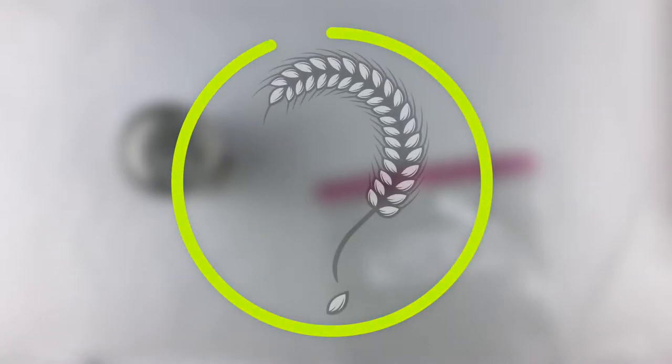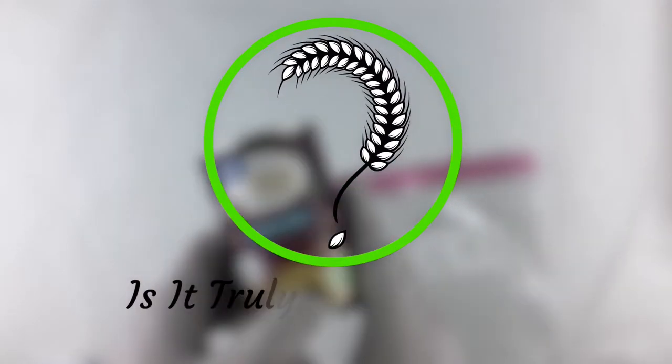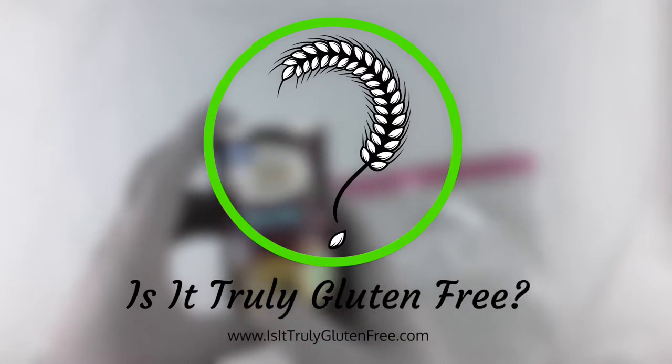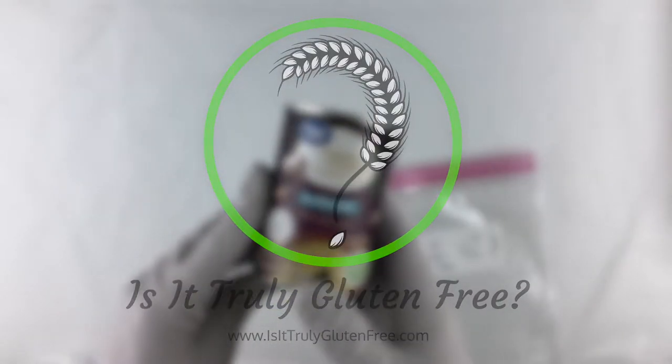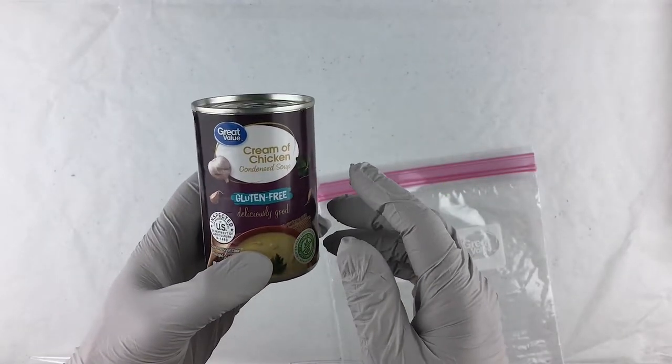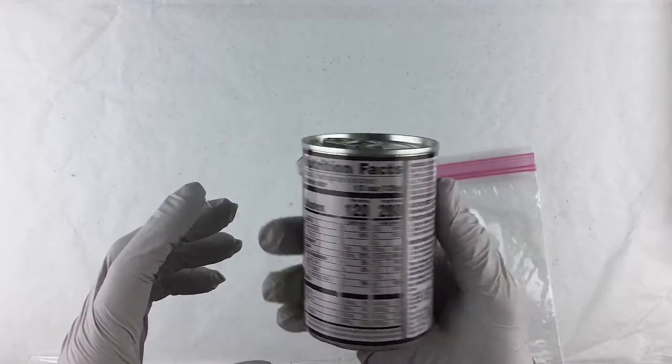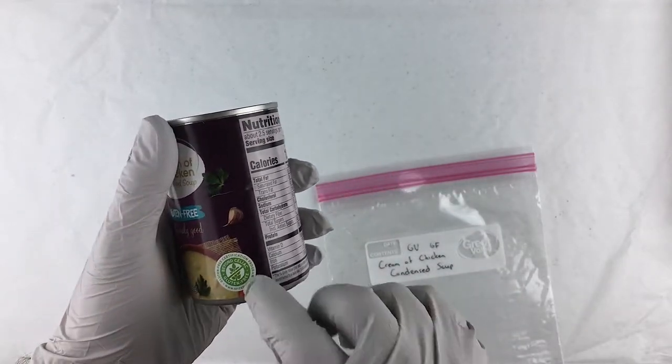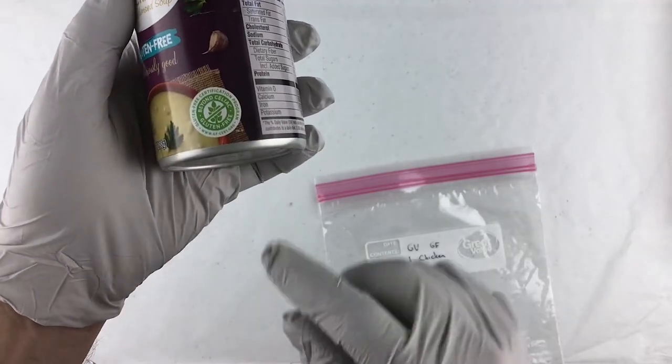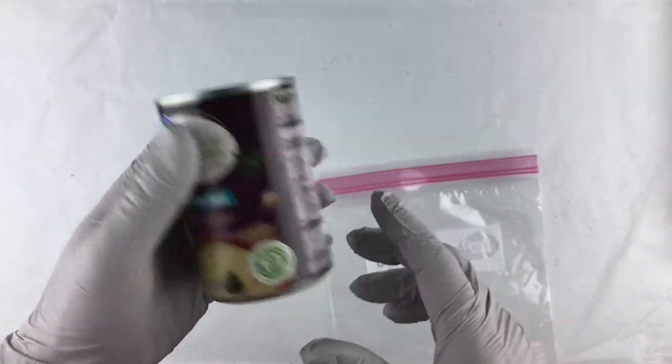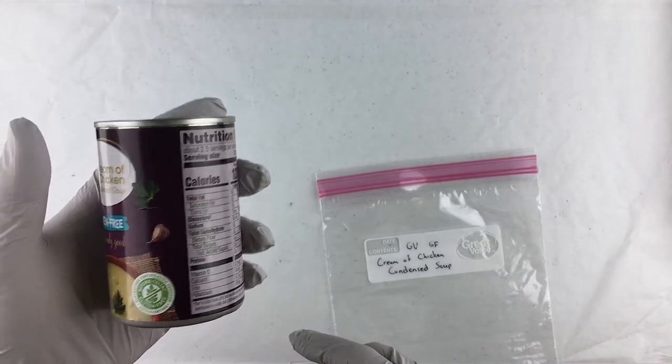Hello and welcome to Is It Truly Gluten-Free. At this point I'm going to test this product, Great Value Cream of Chicken Condensed Soup. Obviously this is labeled gluten-free and it also has the Beyond Celiac certification here, which means that it should be gluten-free below 20 parts per million.